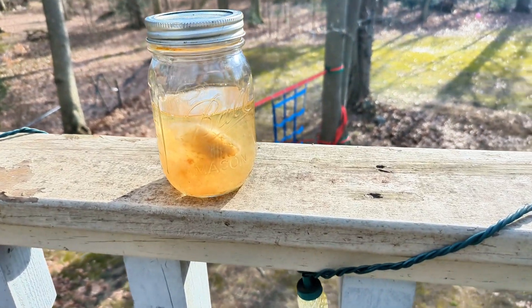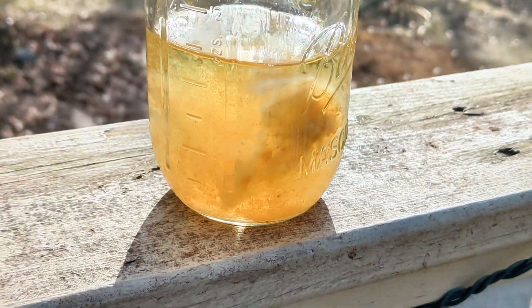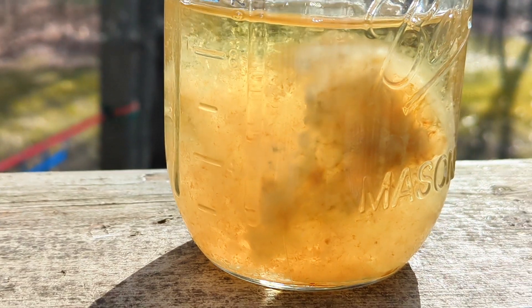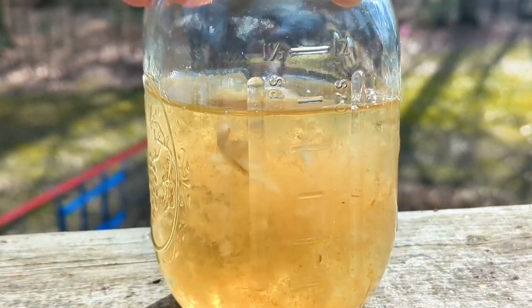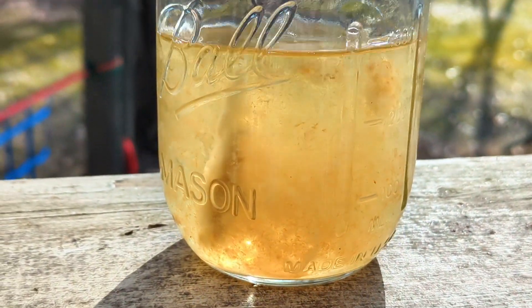Can you guess what's growing in my jar? Even though I'm not gonna drink this gnarly looking stuff, I promise you it's something very cool — something I've been growing for over six months now. My mushroom friends — you probably knew what this was right away, or if you've grown mushrooms before you knew, but if you're new to mushroom cultivation it's probably new to you. So what the heck am I growing in here?